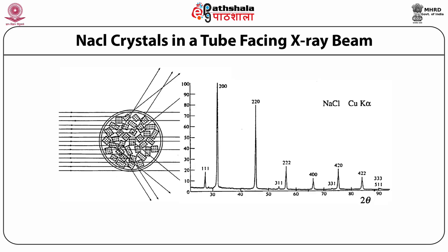Once all d-spacings have been determined, automated search or match routines compare the d-spacings of the unknown to those of known materials. Because each material has a unique set of d-spacings, matching these provides an identification of the unknown sample. A systematic procedure is used by ordering the d-spacings in terms of their intensities, beginning with the most intense peak. Files of d-spacings for hundreds of thousands of inorganic compounds are available from the International Center for Diffraction Data as the powder diffraction files. We call them PDF. Many other sites contain d-spacings of minerals, such as the American Mineralogist Crystal Structure Database. Commonly, this information is an integral portion of the software that comes with the instrumentation.